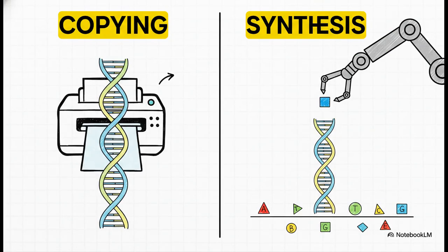And that's the real kicker here. We're not talking about just making copies of existing DNA like PCR does. Chemical synthesis is building DNA from the ground up, letter by letter, without any template at all. It's pure creation. But man, figuring out how to pull that off was a massive challenge.